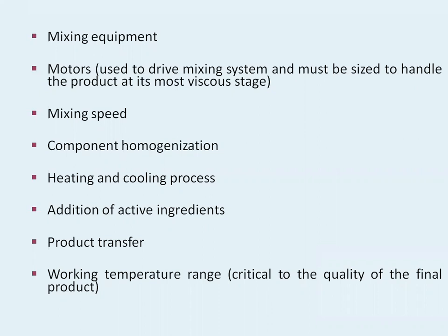So heating is very important. Heating temperature is very important. Cooling process is very important. If we heat those waxes, or the carnauba wax or the cocoa butter, they may change their properties if we heat at a higher temperature or it is overheated.